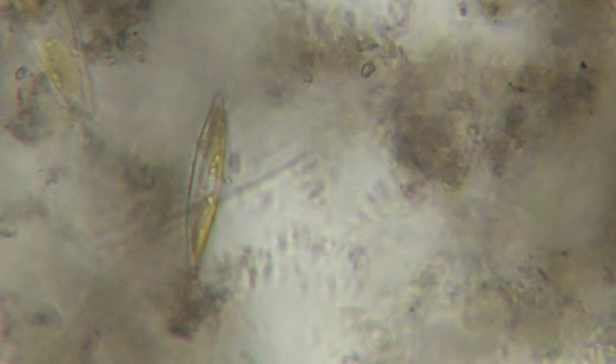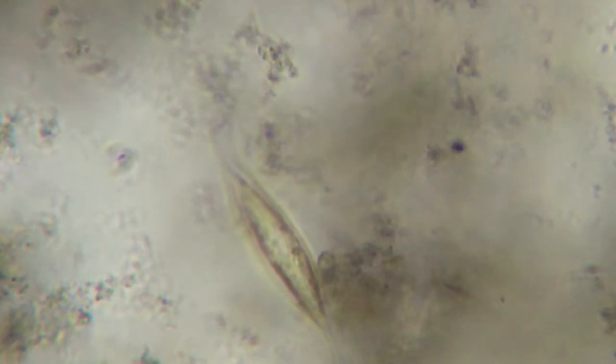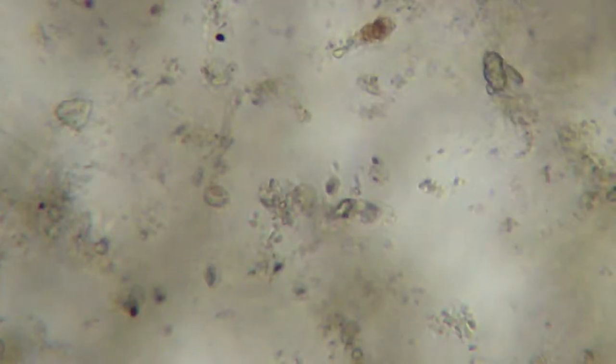Yeah, pretty cool. More diatoms there, cigar-shaped ones. Let's just cruise around and zoom in and see what I can see here. There's another cigar-like pinnate diatom there. Another one there, that's the one with little tapered bits. See the oil droplets in that one. Small oil droplets. So yeah, this is diatom craziness in this one. There's another blunt one that has a different shape. Long bar of photosynthetic material in the middle. Another bar-shaped one. That's an interesting structure there.